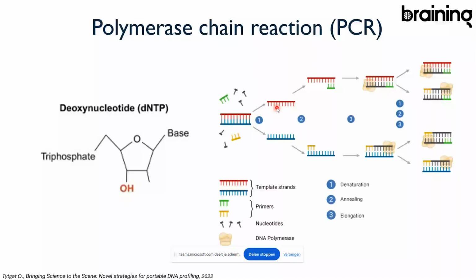And to be able to copy those strands, you need three components. The first thing is you need a DNA polymerase. That's the enzyme that's going to include bases based on a template strand. The second component you need are the bases themselves, the deoxynucleotides. So you have adenosine, thymine, guanine, and cytosine, right? And important is that they are deoxynucleotides. So you see this hydroxyl group here. This hydroxyl group is very important for the DNA polymerase to be able to put the next base. If this hydroxyl group is not present, the reaction cannot continue.